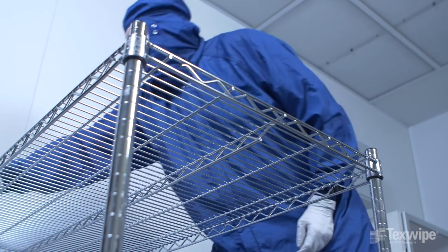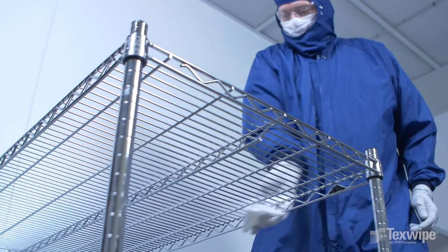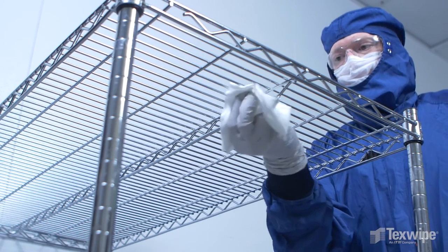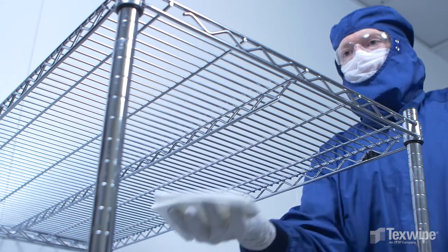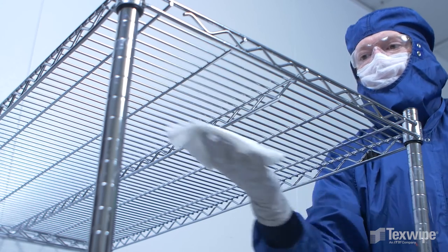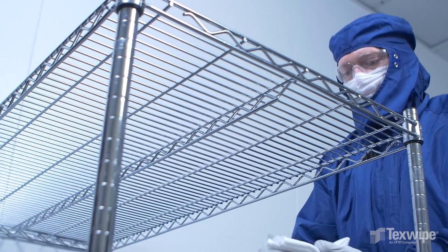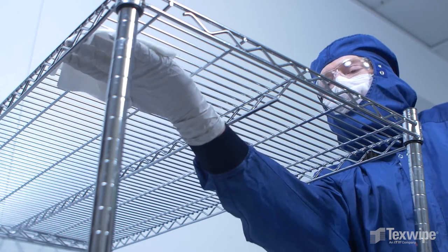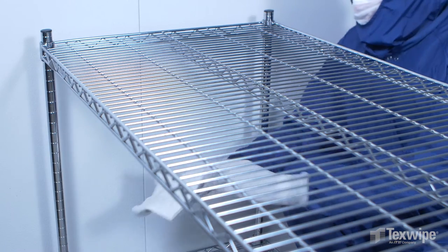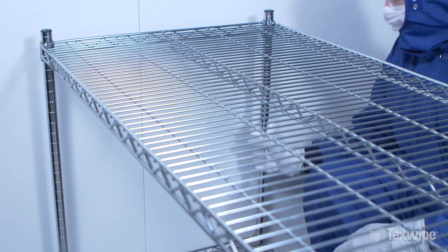The next step is to clean the edges starting at the back. The edge nearest the camera interacts with the environment the most, so it is cleaned last. Now clean the underside of the top shelf — first wipe the center rib or support bar, then clean the sections of the underside. Remember to work back to front and in one direction across the shelf's underside. Wipe the legs that support the shelf, starting at the back where it is cleanest to the dirtiest leg. Refold the wiper after each leg.